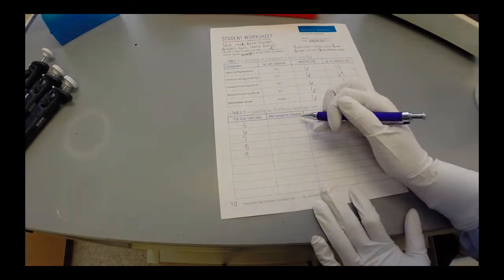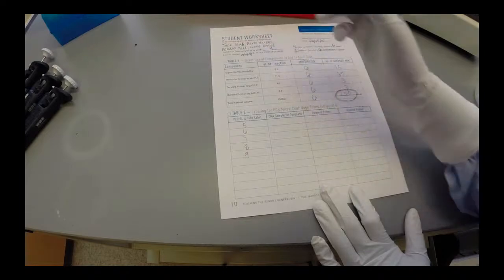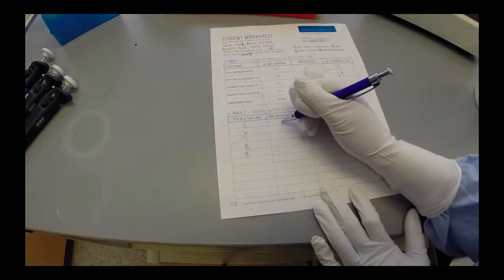The sample names are filled out in the second column, and the primers used for each sample are filled out in the last 2 columns.